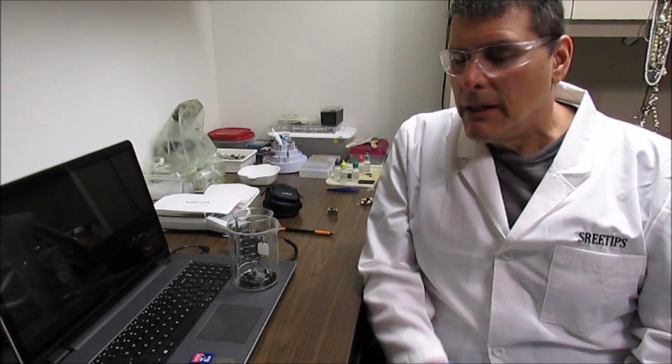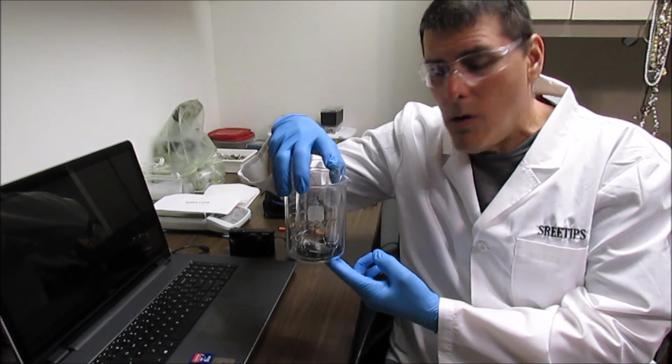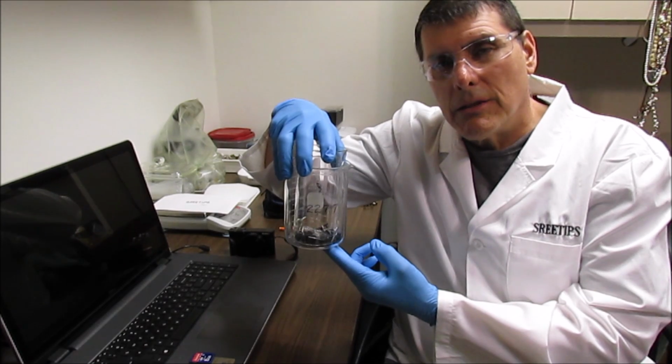I'm Tips. And today what I'm going to do is the final stock pot refining series video. We're going to refine this black mixed PGM powders into some pure metal.